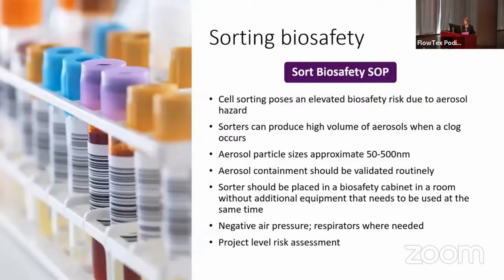I never talk about sorting without first pointing out that sorting is an especial biosafety hazard. It's best done in core laboratories, in my opinion. Cell sorting is an aerosol hazard. It produces aerosols during a clog, typically. So if the sorter is running well, it's not producing aerosols and it's not terribly hazardous. But once there's a clog, you're going to get aerosol particles that are clouds that can be visible, actually. And these particles will be about 50 to 500 nanometers, so they're the perfect size to get really deep down in your lungs.